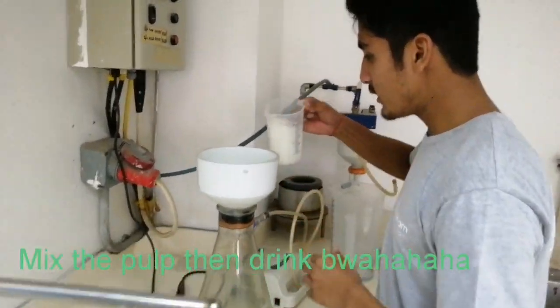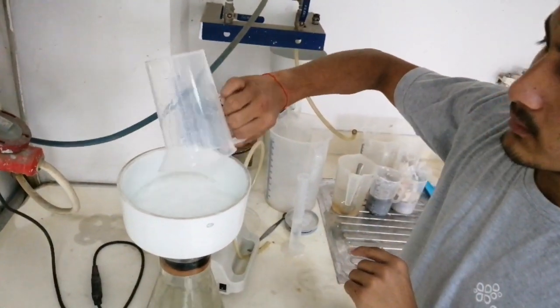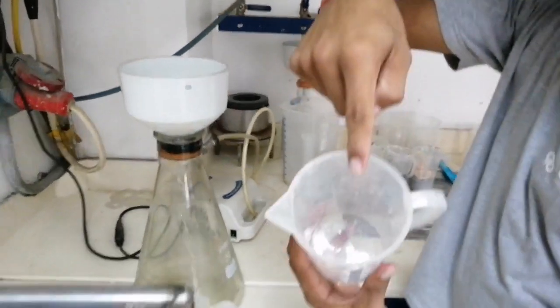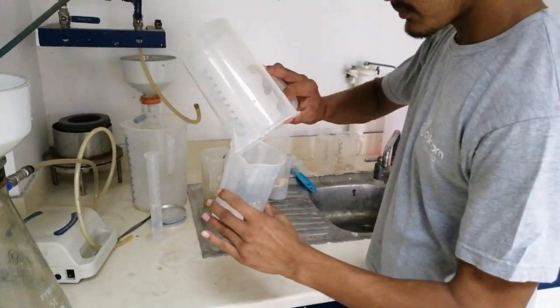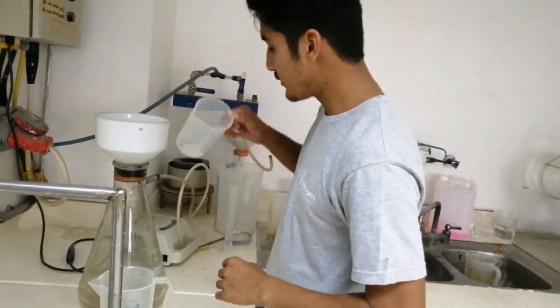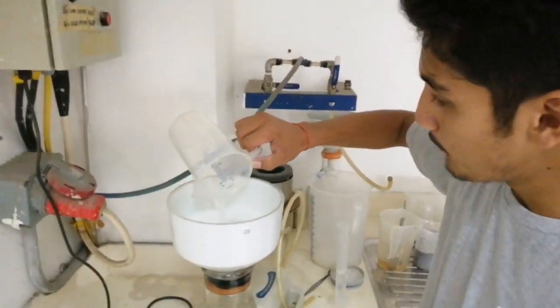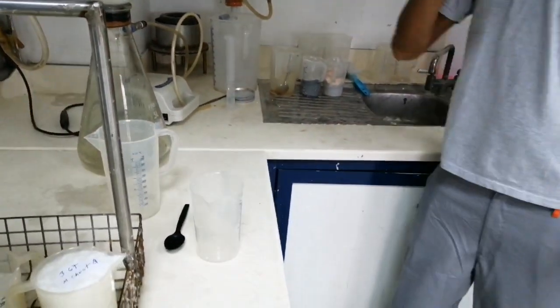I am going to put all of this in. You see here — so there's still some remaining, so you need to put everything because that is included in the weight. It's already weighted, so everything must be put in. See, all clear. Now, this one is finished.